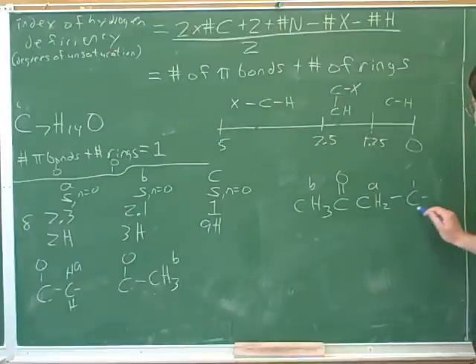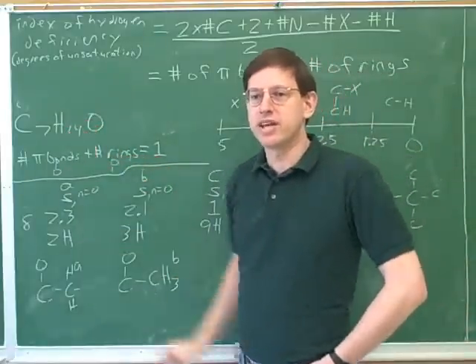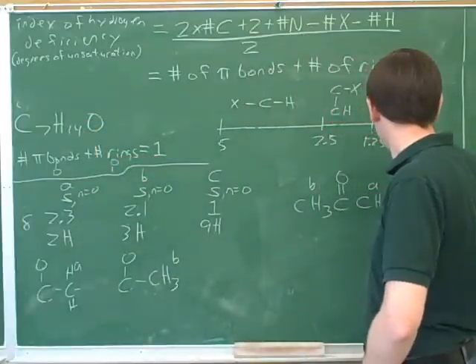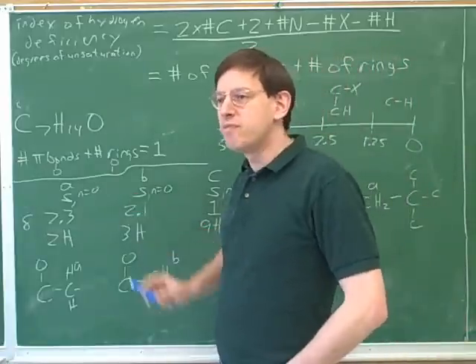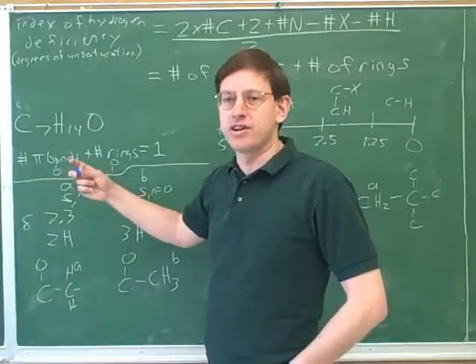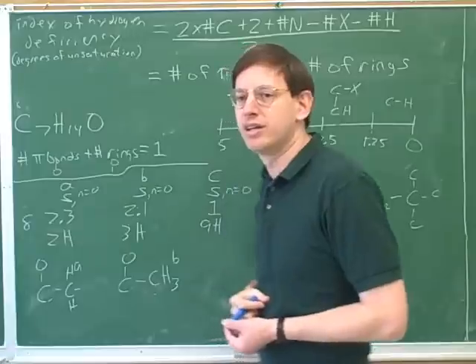So what are the three other things this carbon's attached to? Carbons, because that's all that we have. All we have here is carbons. This can't be attached to any hydrogens because if it was, there would be splitting. And we don't have any splitting here. These are all singlets. Remember, you're split when you're adjacent to other hydrogens. And if you're not split, you can't be adjacent to any other hydrogens.